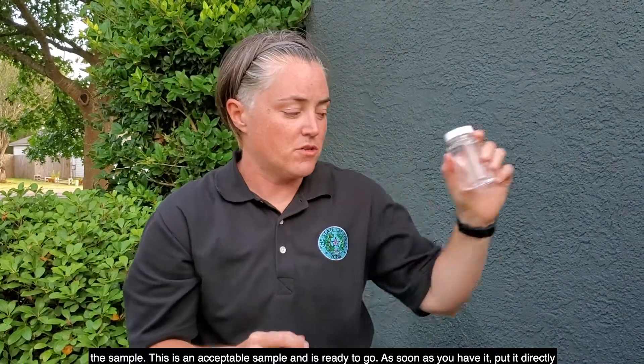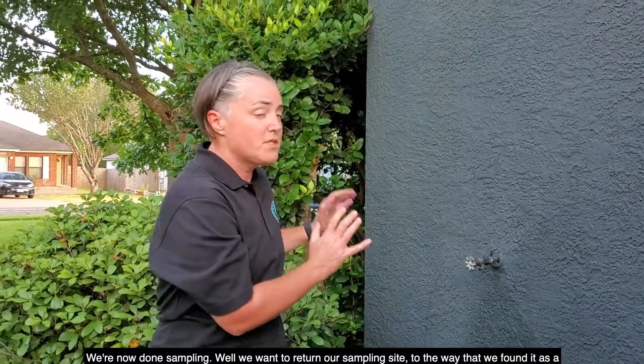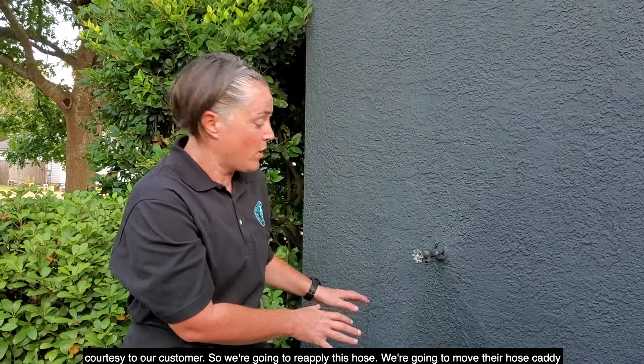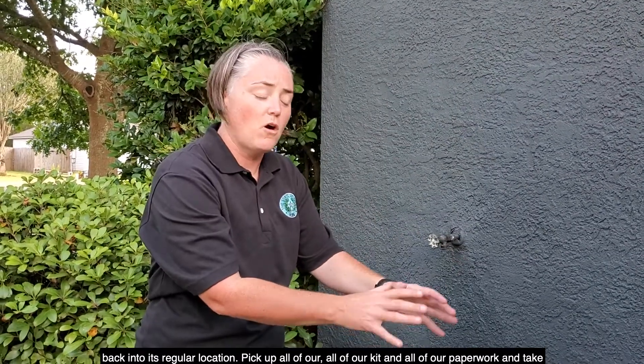As soon as you have the sample, put it directly into your ice chest with the ice and close it. We're now done sampling, but we want to return our sampling site to the way that we found it, as a courtesy to our customer. We're going to reapply the hose, move their house caddy back into its regular location, pick up all of our kit and all of our paperwork, and take it back with us in the truck.